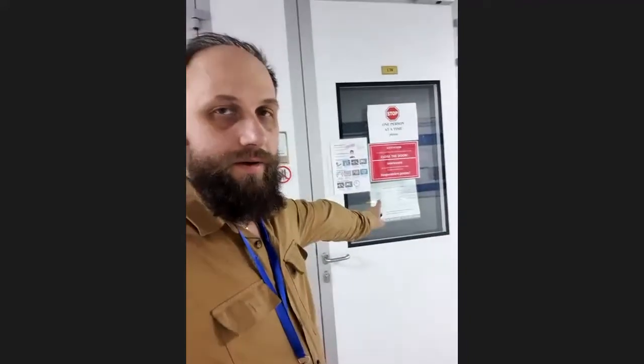So, I am Dr. Alexandr Arbuz, and I work in a core facility. My position is research facility coordinator, and I am head of the electron microscopy lab. We have an electron microscopy facility situated in the C4 block. The first floor of C4 is our lab. We have the main part of our lab here with the microscopes, and one more lab for sample preparation. So let's start from the main facility.